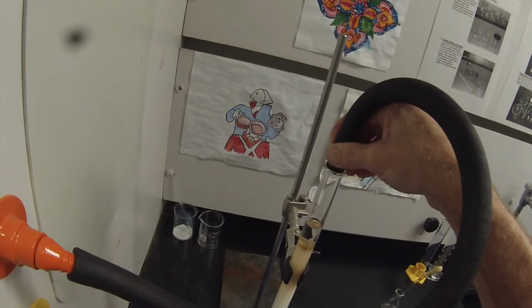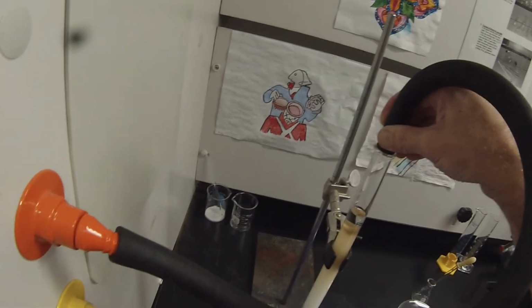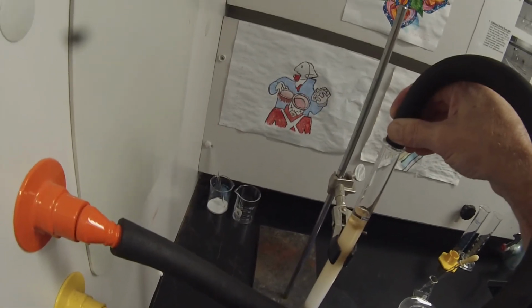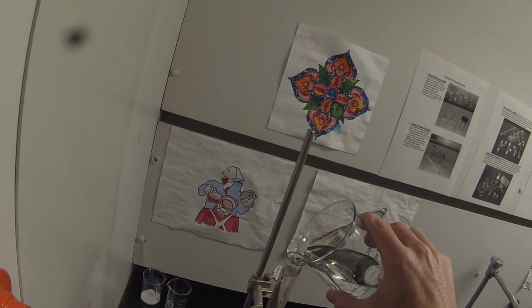You'll notice that by going through that kind of serpentine, I don't have to switch from this tube to that tube. It prevents me from kind of spilling. I just got to keep an eye. Right, basically 2 tubes and then refill. At this point it doesn't matter as much if I disturb the top, because my compound's down here somewhere.